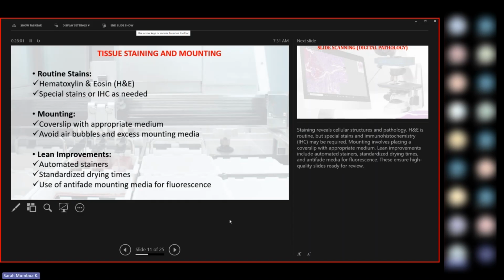Remember, if you're overstaining with hematoxylin, before you do the counterstain you remove the excess hematoxylin by using 1% acid alcohol. Then you blue. You can blue even with tap water. If you do not have the bluing agents, you can blue with tap water. Then you counterstain with eosin, which is our routine stain here. I hope you know the staining principle of hematoxylin and eosin. Here we are targeting the tissue cells, the basic part and the acidic part. The acidic part should be stained by the basic part of the stain, and the other way around. So this one you have to be sure.